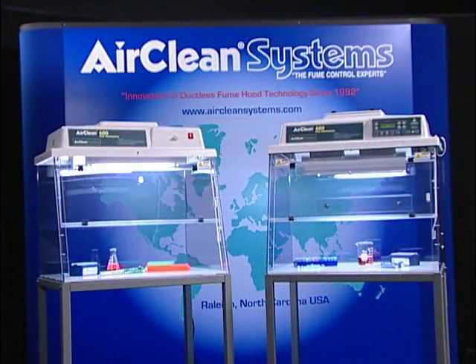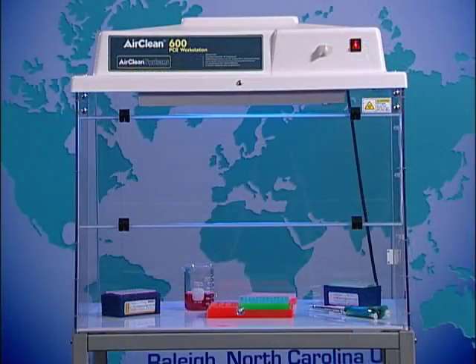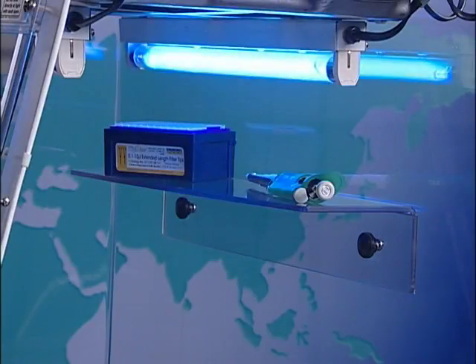AirClean Systems PCR workstations are available in two different configurations. The dead air box provides a circulation-free environment with UV light sterilization. This configuration is very popular, but it does not provide a total application solution. The combination workstation is designed to provide a Class 100 clean bench work environment and UV light sterilization.